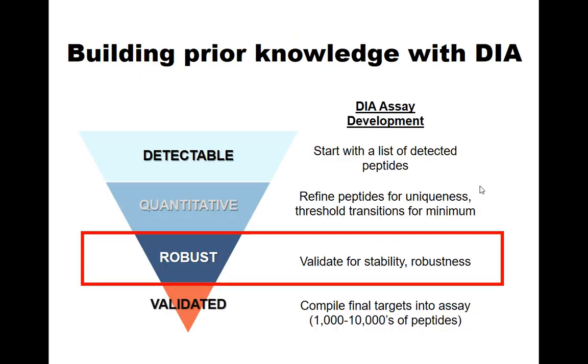So right away, this is taking care of some of the most basic filter thresholds for what a quantitative peptide is. For detected, it's not a problem. You don't have to worry about that. But for quantitation, we want to make sure we have a minimum number of transitions and a minimum number of peptides per protein. So now we start thinking about robustness, and this is kind of where Andy Hofnagel's talks start to come in. How do we calibrate a signal to a quantitative value?